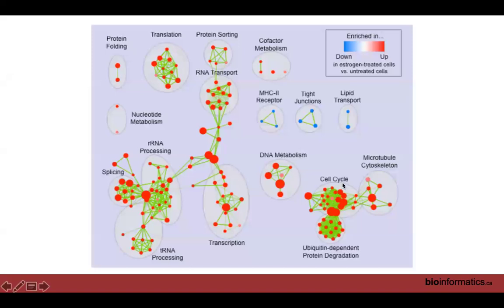What you can see here is a simple network where each node represents a pathway, and the connection between the nodes represents the relationship between those two pathways. Pathways outlined in red are upregulated, and pathways outlined in blue are downregulated. In addition to the nodes, you'll also see additional annotations on this network. You'll see circles around subsets of nodes with some sort of summarization term.